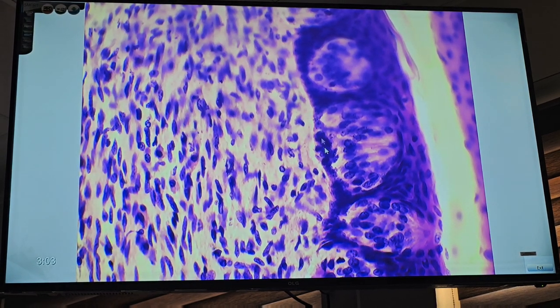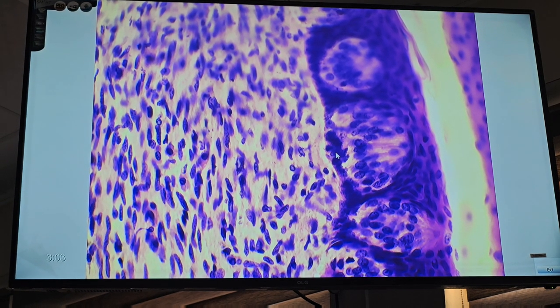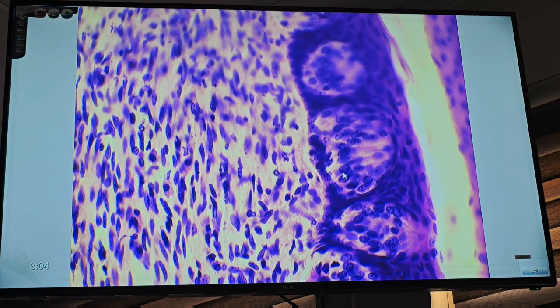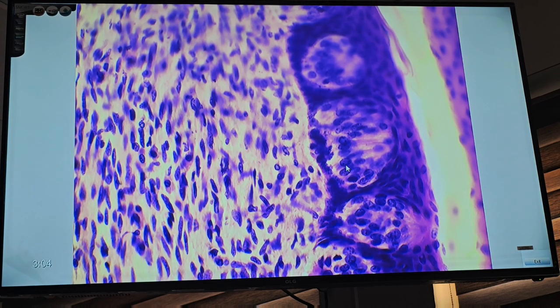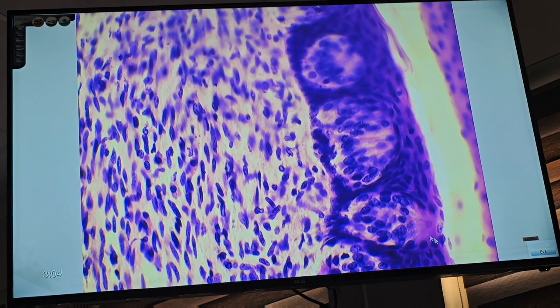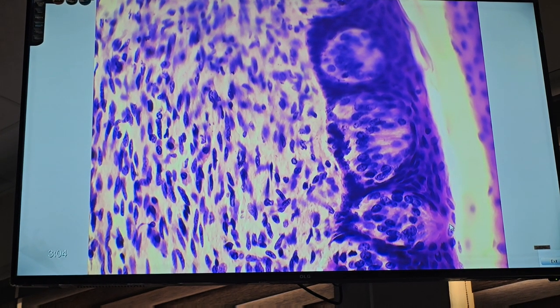Basal cells, these cells also divide and give rise to other cell types. Resting on the basal lamina, basal cells. At the tip of the pointer, we can see the taste cell or sensory cell, also called gustatory cell. This cell is a bipolar neuron. The apical end of this cell has microvilli extending toward an opening called the taste pore. This is the taste pore.